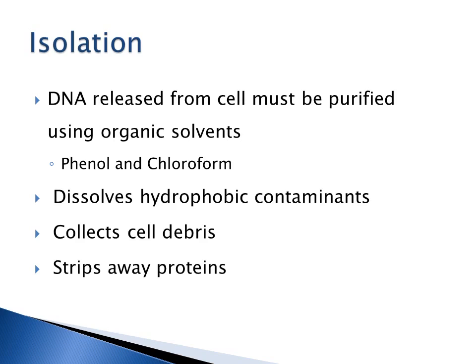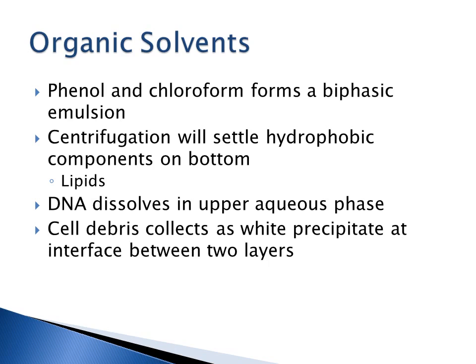What the phenol and chloroform do is dissolve hydrophobic contaminants. You can collect the cellular debris and it's going to remove proteins. So you end up with nice, clean, pure nucleic acids, and that's always your goal with nucleic acid extraction. You want that nucleic acid to be nice and clean and not have anything else in there that's going to affect another protocol that you might use.